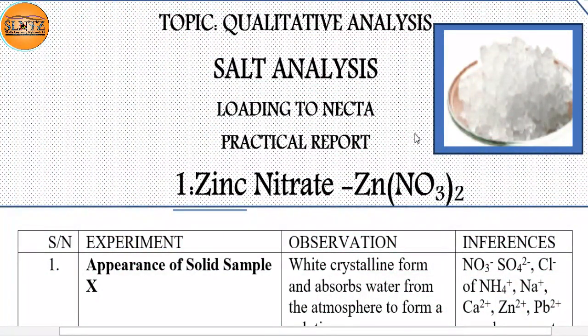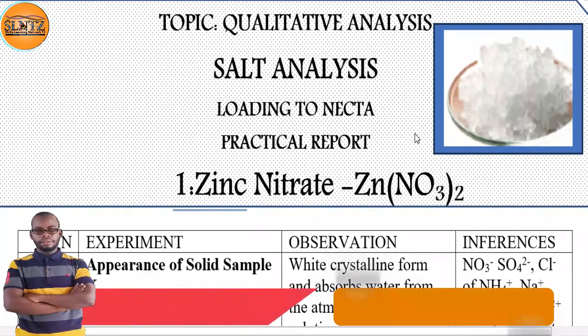Our subject is chemistry and this is chemistry practical. Our topic is qualitative analysis. We're going to learn about salt analysis. During the preparations for examinations, if you are a student going to sit for examinations, you have to know about salt analysis.